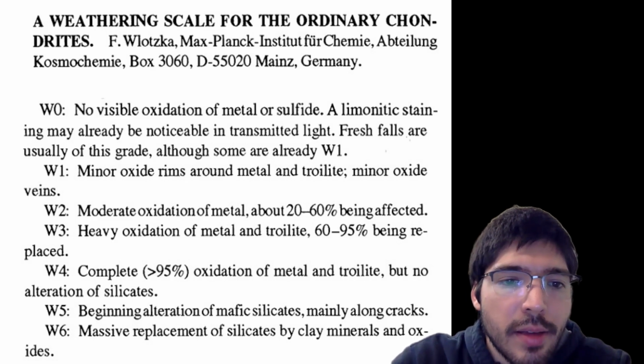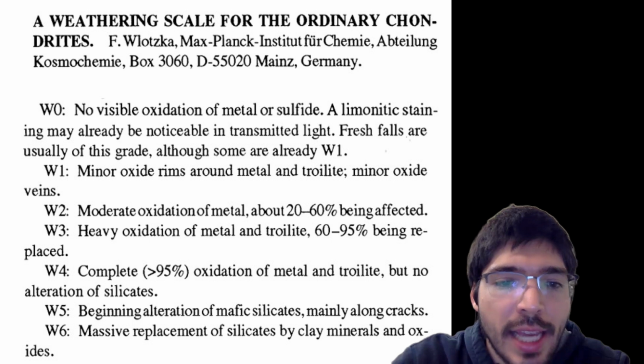And we can also check this if we look at the hand specimen. You can look at the metal and see how much of that metal looks clean, how much of it looks altered.